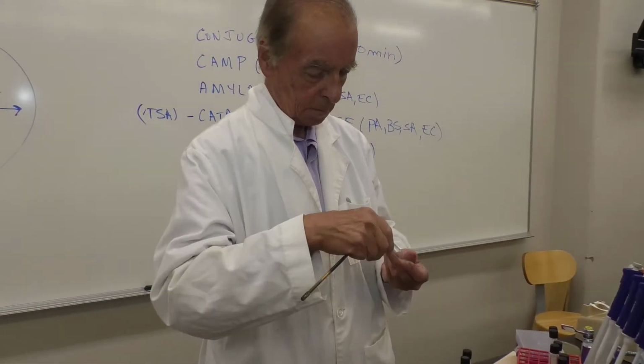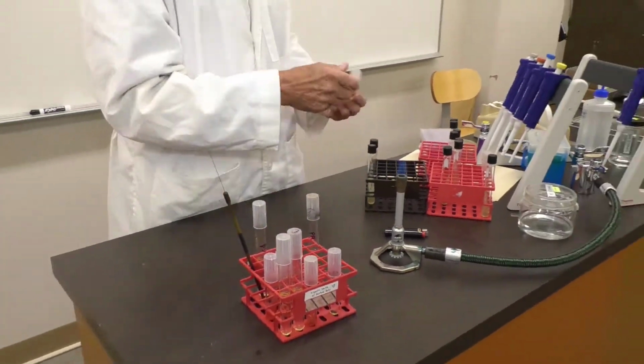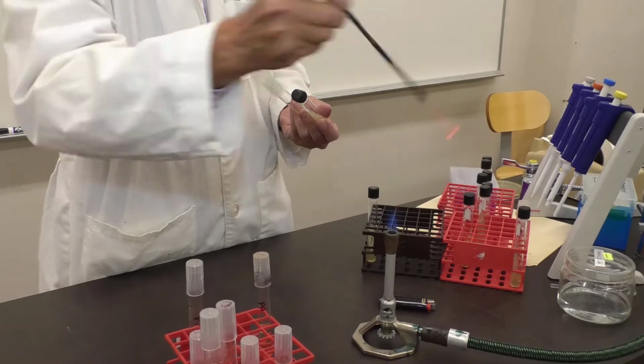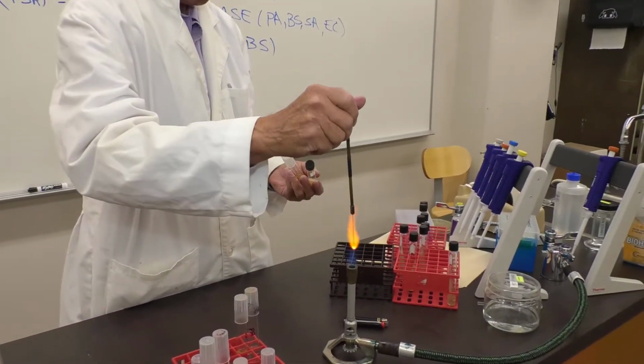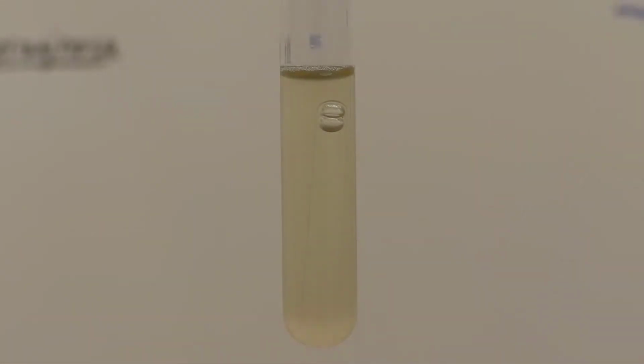So we're inoculating a series of nitrate broths with 3 different organisms to see what they do with the nitrate. Do they dump their electrons to nitrate? So this is nitrate broth with a Durham tube in it. If the microorganism dumps its electrons to nitrate, it can reduce it to nitrite and further to nitrogen gas.